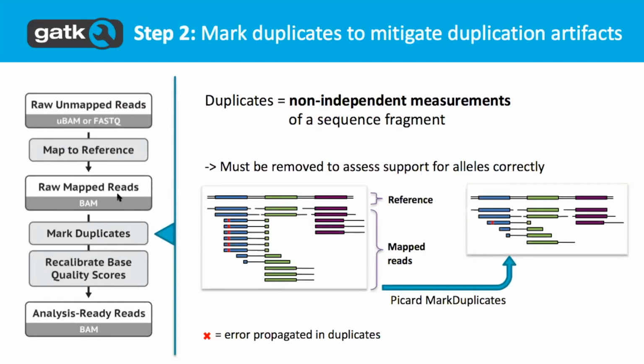Sorry, I'm not sure about that. No worries, that's an implementation detail. What we do is the mark duplicates step across all of the lanes, all of the read groups, because there are really two types of duplicates. Some of them are at the library level, and you want to be able to identify those. By providing all the data together, we're able to do that kind of cross-library, cross-read group duplicate marking. We do it the same way, regardless.